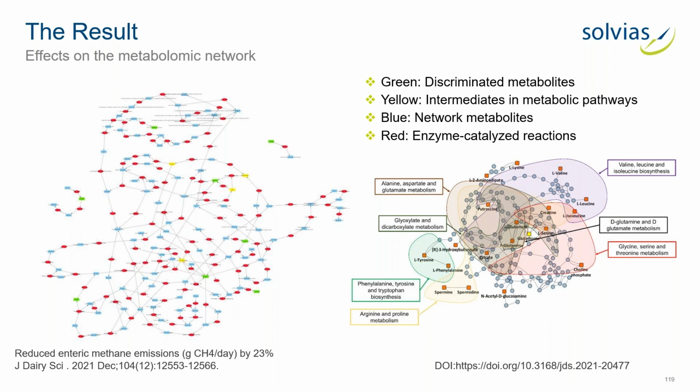But the most important information is that you now have the possibility to get from these huge datasets information that tells you really what the difference is, what happened when you treat an animal or a human or whatever you would like with a sample. You can go for bacteria; bacteria genomes are already discovered, also small animals, larger animals, plants, whatever you want.